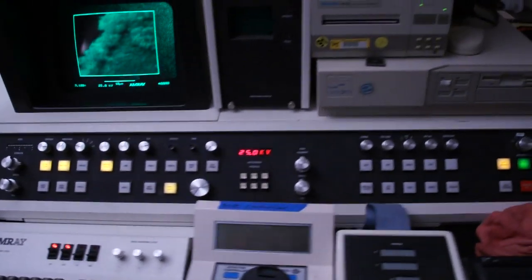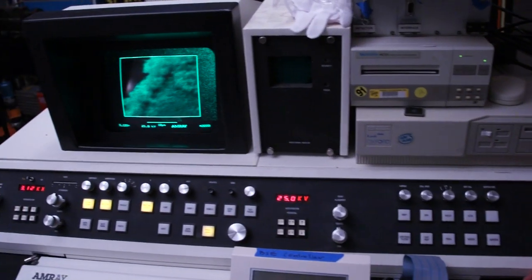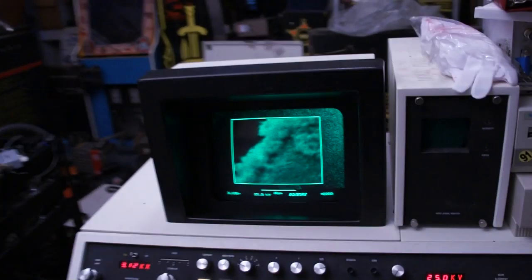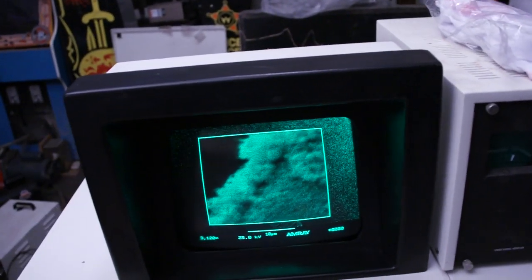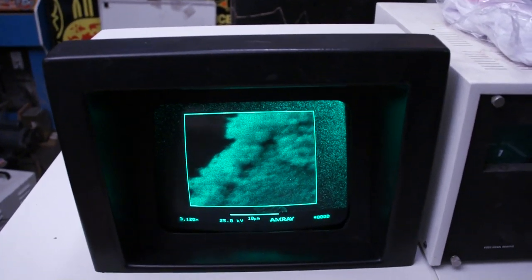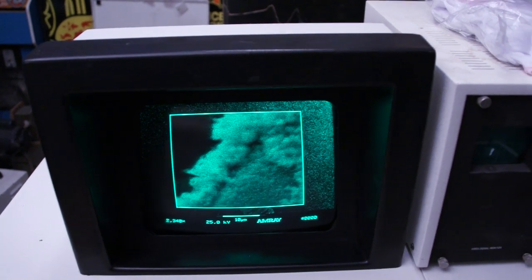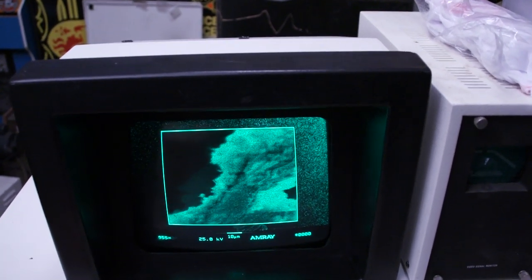All right. I guess I'm just rambling now. So I'll just call it quits there. And I hope you enjoyed this little tour around an electron microscope. I'll do more videos when I get better at working with it.